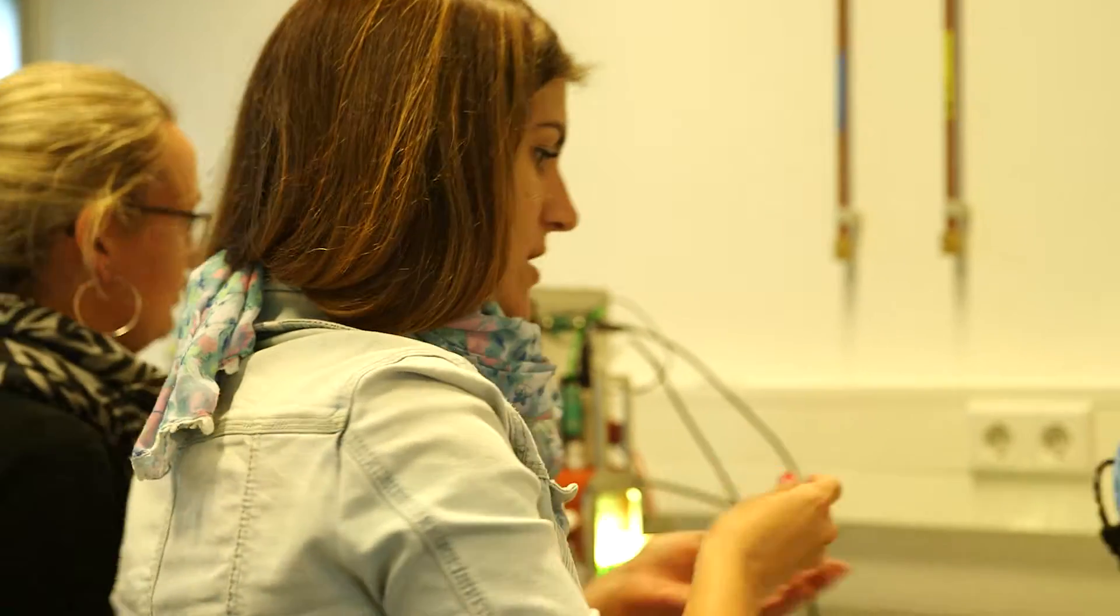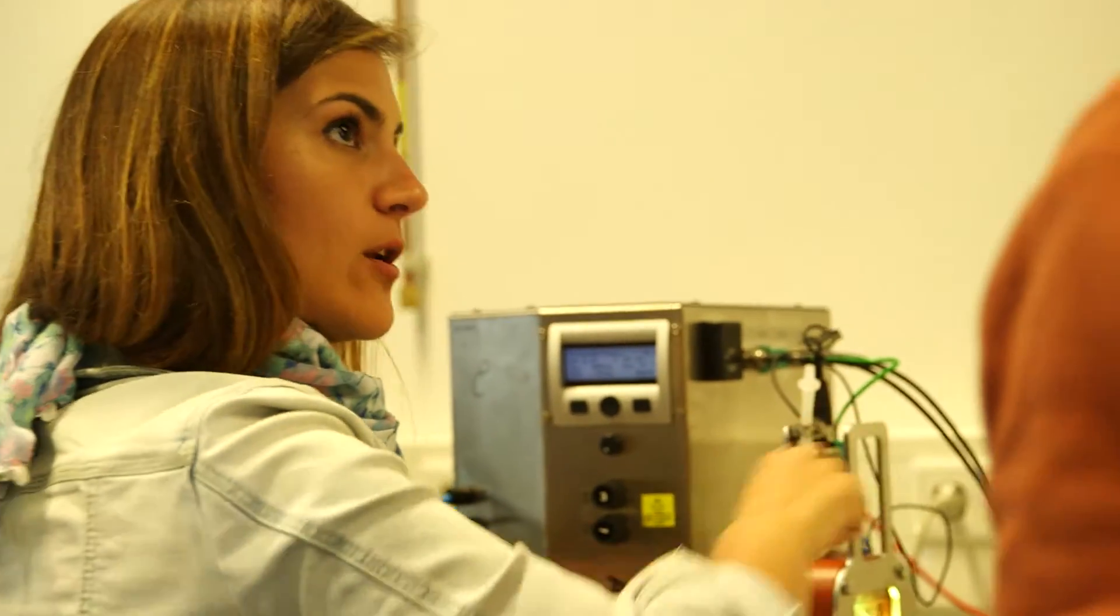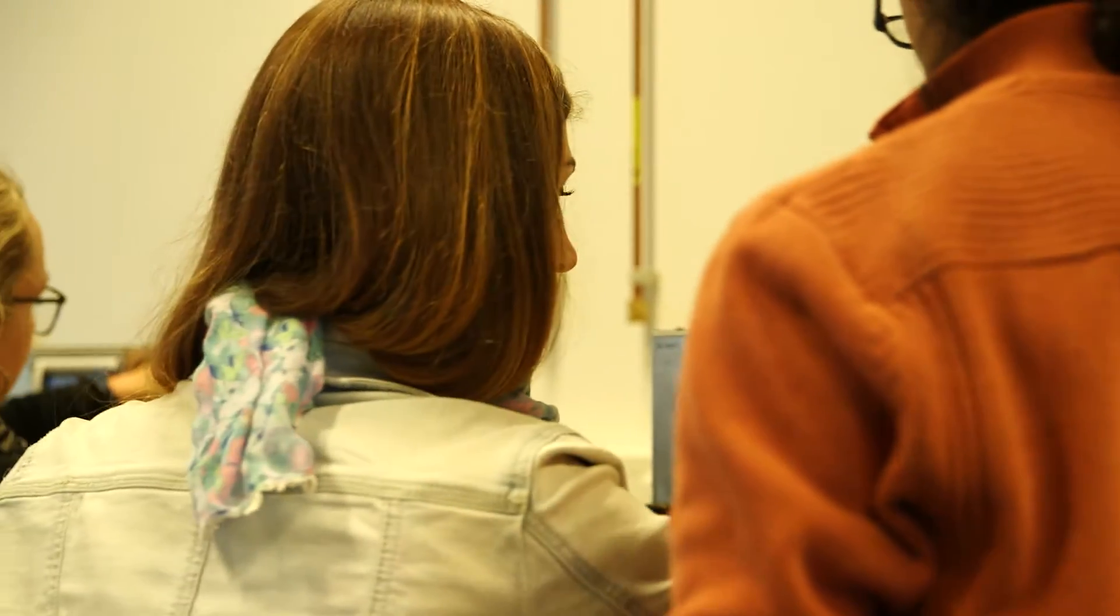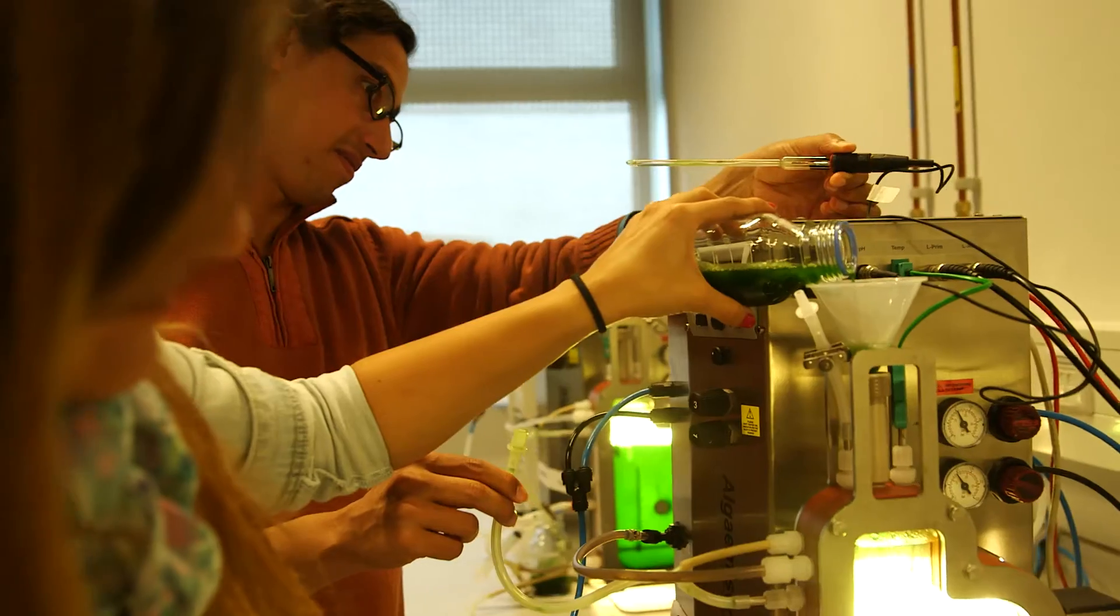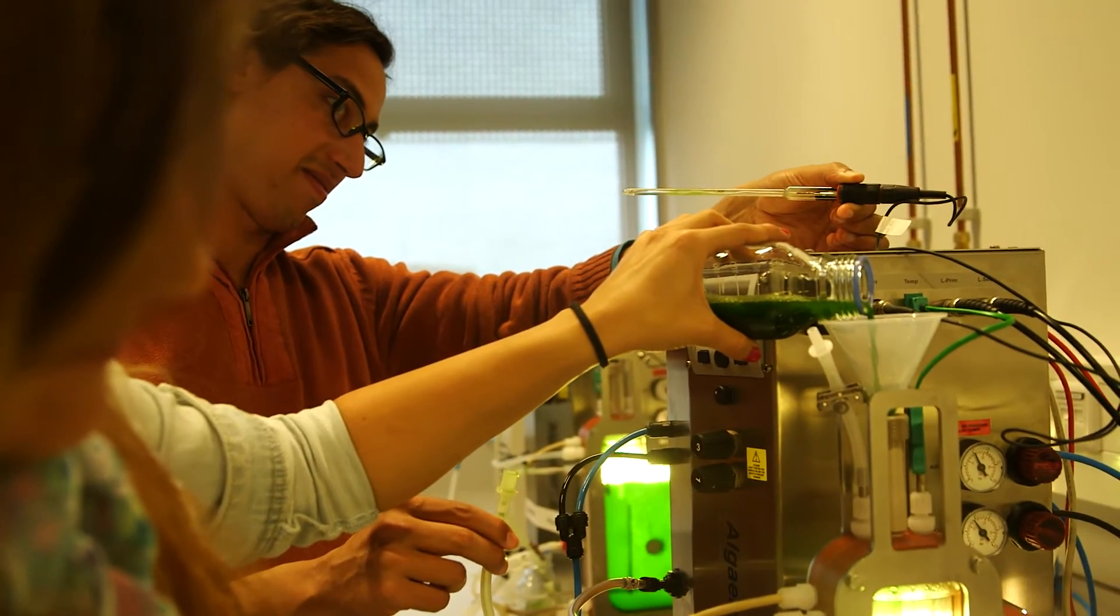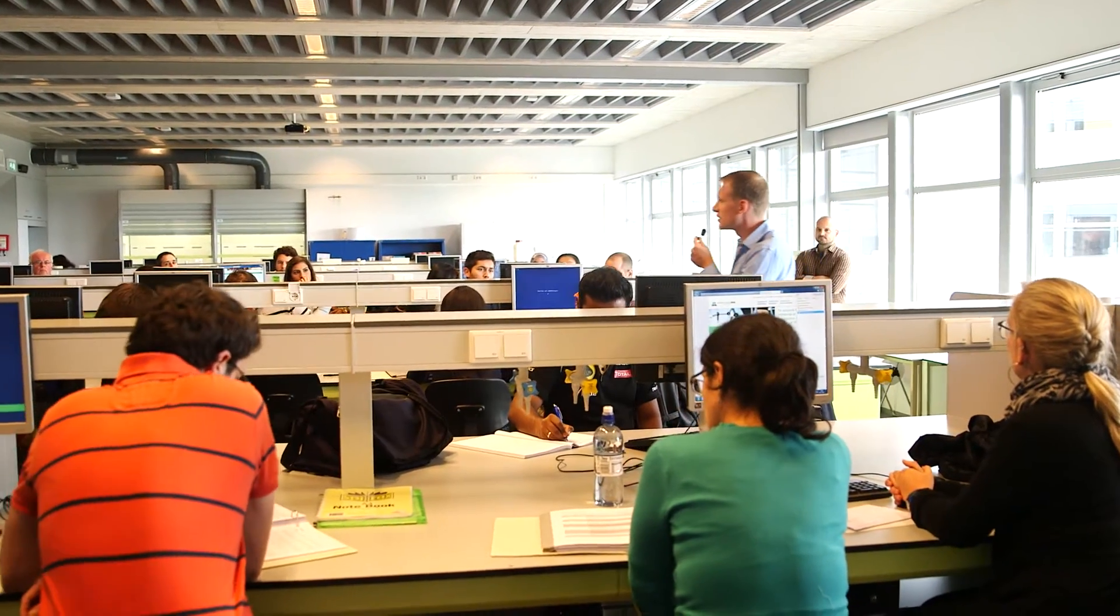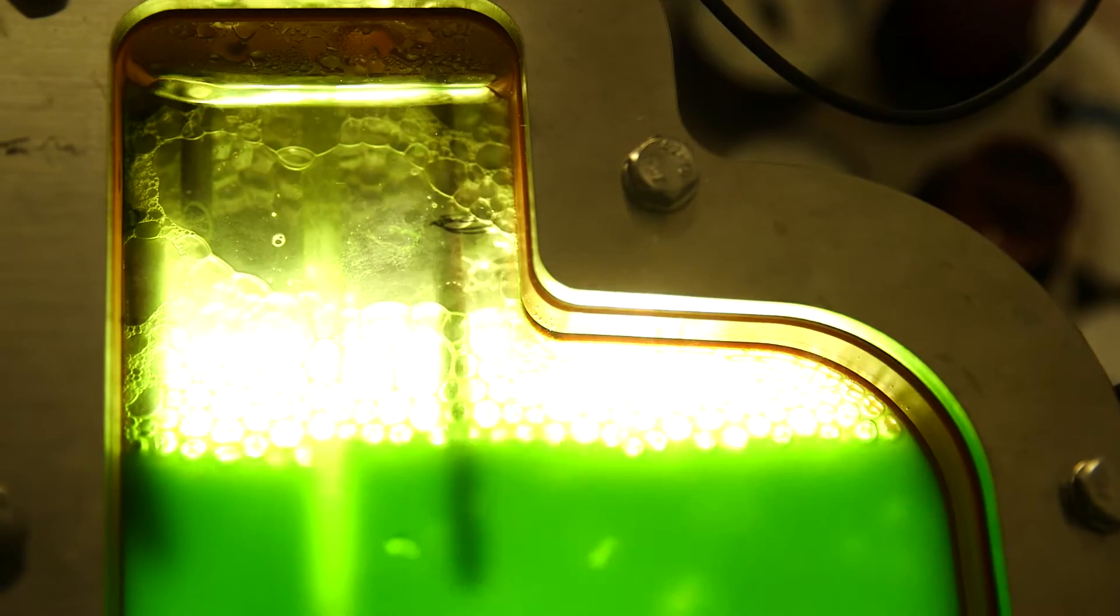We are learning how all the different parameters affect the cultivation process, so we can predict how a change, for example in nutrients or light, will affect the productivity of our production process.